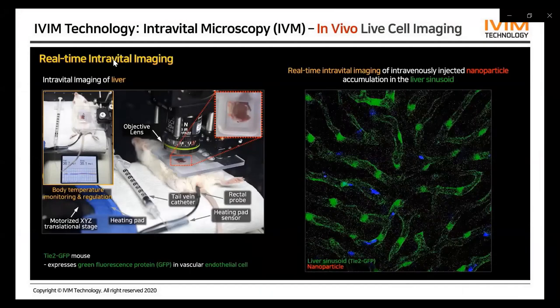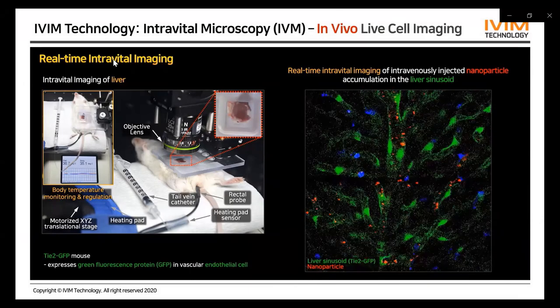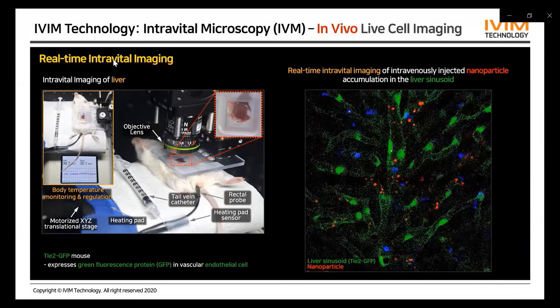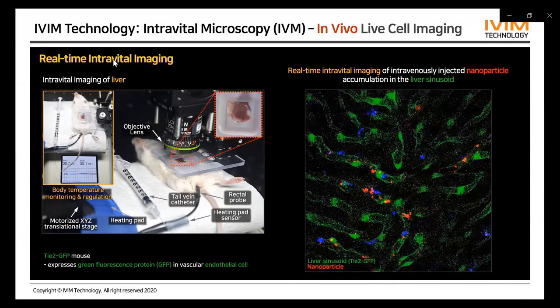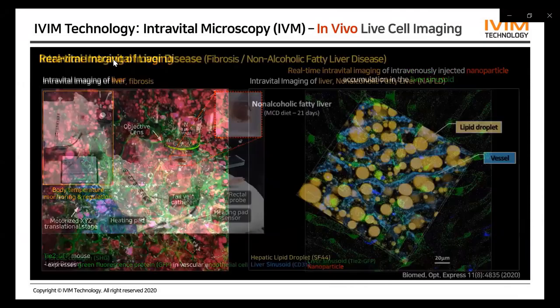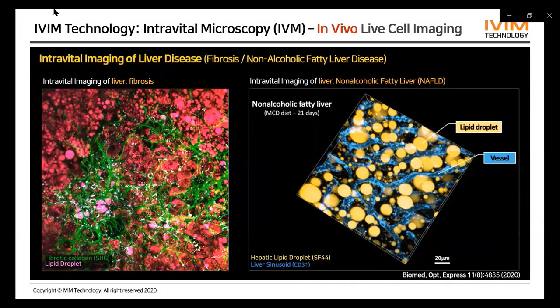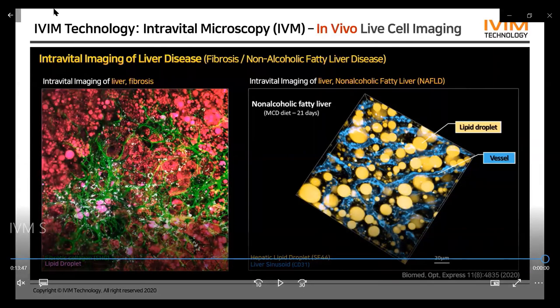This is an example of nanoparticle delivery and accumulation in the liver sinusoid captured by real-time video. The red fluorescent nanoparticles were delivered into the liver sinusoid right after injection via tail vein catheter, and then accumulated to a specific site of the liver sinusoid over time — you can see the dynamics of nanoparticle accumulation. When this live in vivo liver imaging technique was applied to a fatty liver disease model and liver fibrosis model, we can clearly visualize the development of fibrous collagen and lipid droplets in liver tissue.